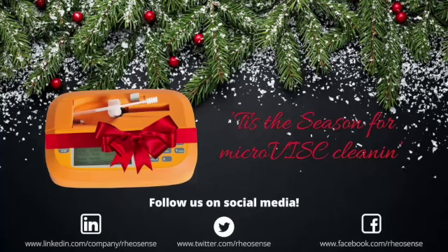Go ahead. It's a little loud, so I'm going to go ahead and slide it away from the mic.